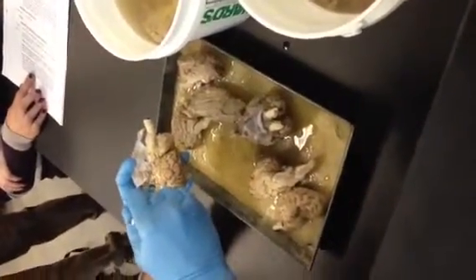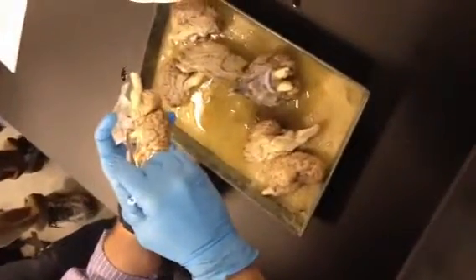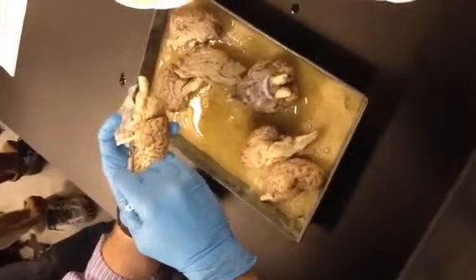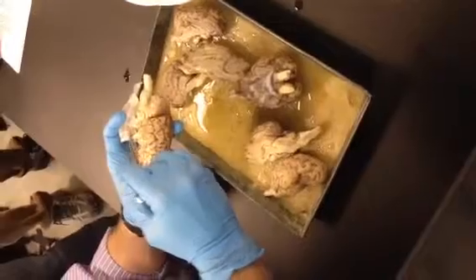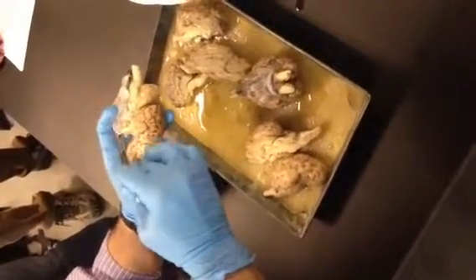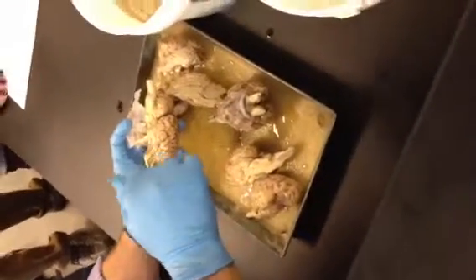By the way, this is this one right here. This is oculomotor nerve, just so you can kind of see, but it's kind of hard to tell. So I won't test you on the sheep brain because they're just too small. Plus, they don't last long. As soon as you get them out into the air, they start to dry out. Okay? Those little nerves are hard to see. Okay, next thing.